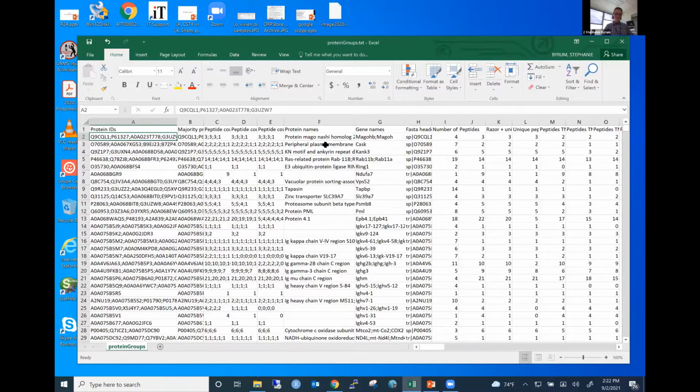Then what I do for the analysis is actually truncate this to that first ID that is listed. So when we're doing our analyses and you have the UniProt accession numbers, it's going to be pulling that very first one that has the most confidence for the identification into a nicer data frame to do all of our processing. So that is one thing that I am using. And you can kind of see that here, the majority of protein IDs. Some of them have a different column that's the leading protein. Just again, kind of depends on the parsing, but I'm not seeing that one in this particular output.